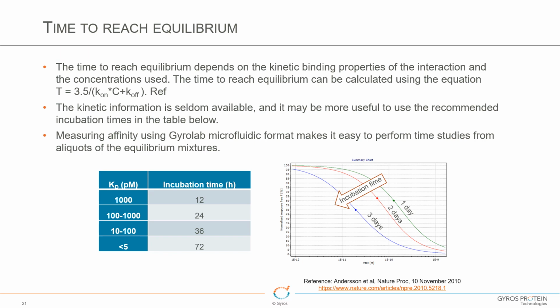So it's just a guide for how long to leave your reaction. And you can do a time course experiment where you leave your reaction for increased time and then compare the calculated KD. Right, and you can see in this example, as you increase the incubation time, that KD value stabilizes and shifts to the left until we've achieved true equilibrium. We're going to underestimate it at earlier times.